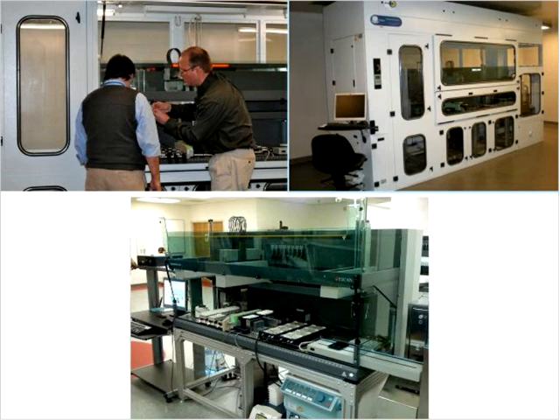So this is to give you a sense of, if you look at the bottom picture, the automated accessioning system when it was being validated under BSL-2 conditions at Los Alamos National Laboratory. And you can get a better sense of the automation. It allows us to have researchers send in either 2 or 5 mL cryotubes and then aliquots those tubes out into individual 0.3 milliliter tubes, or 300 microliter tubes, which are then individually sealed so that they can be moved around the laboratory as an individual containment unit.